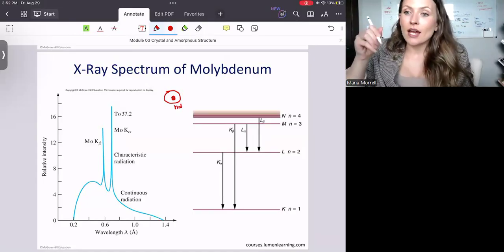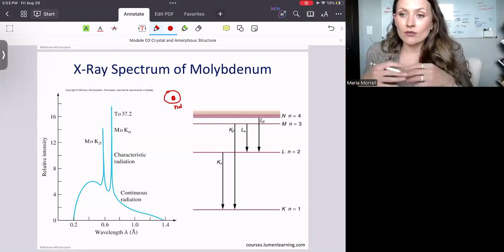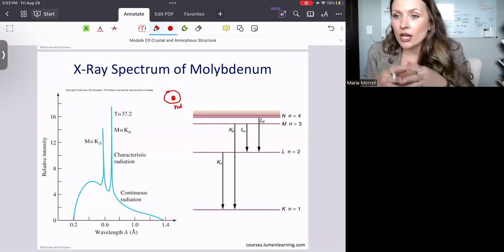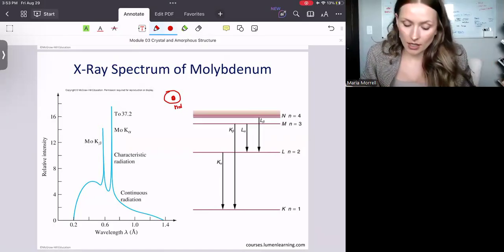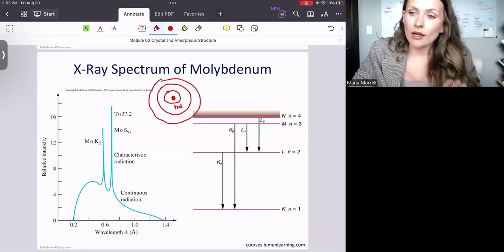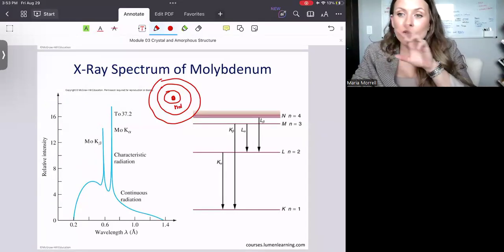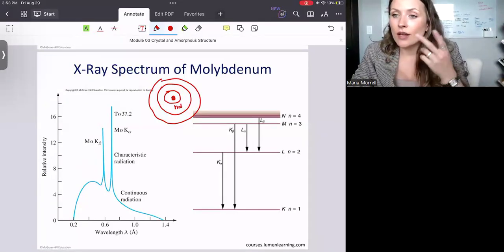I am talking about the electrons that are the closest to the nucleus. And so you can imagine that this is why it requires large energy to actually knock those electrons out. But what happens is that, and I'll show you in a second, now I added two more energy levels, two and then three. And again, these energy levels are very unique for every single material.